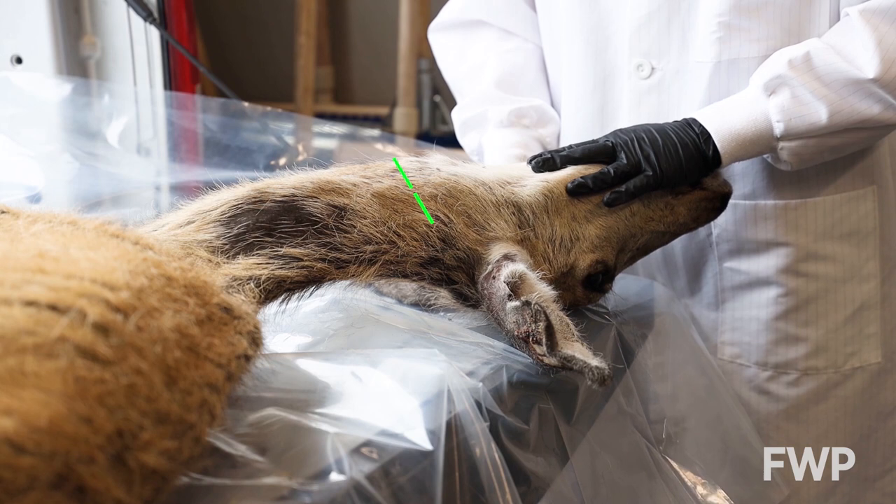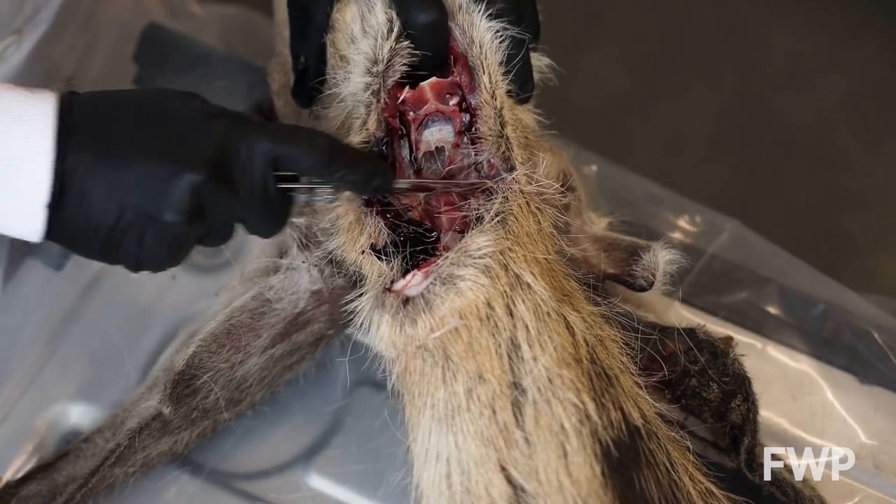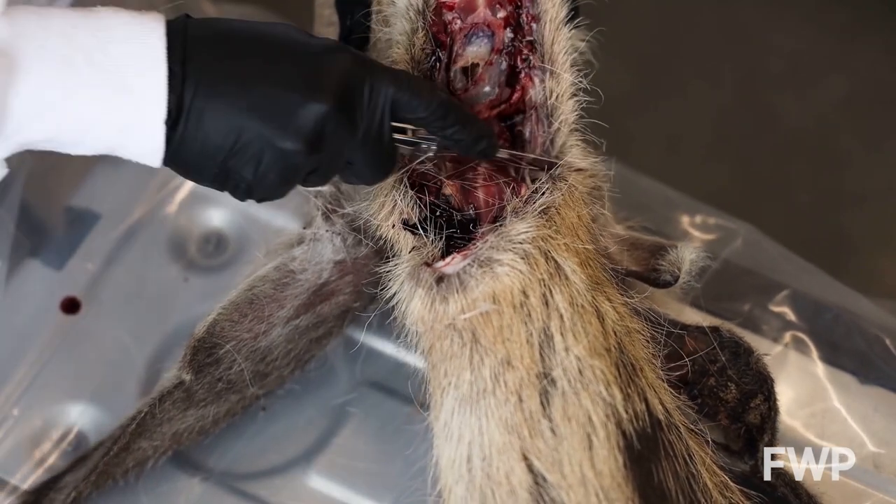Here's another view of how to angle the incision. Widen the incision until you reach the bones connecting the head to the body.